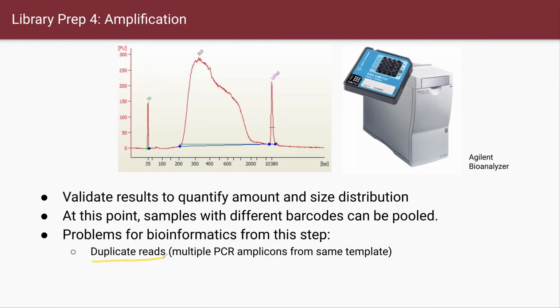So you don't care about this information much in your bioinformatics analysis, the parts later. We generally remove those duplicated, redundant information in the bioinformatics analysis. So if you do many PCR processes, you have a high chance of having this redundant information. So these days, when you prepare the library, you avoid those PCR processes, and you choose to increase the adapter ligation efficiency, right? Okay, so that is the thing you have to remember.